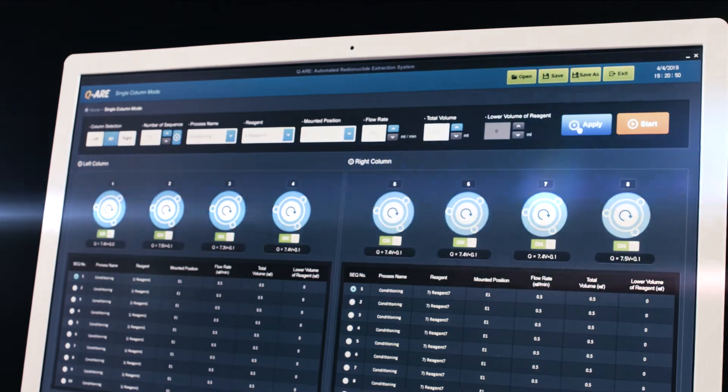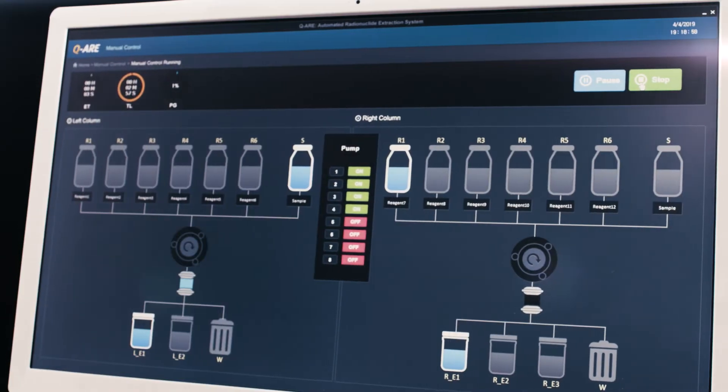The computer-controlled system allows you to run and store methods unique to your research.